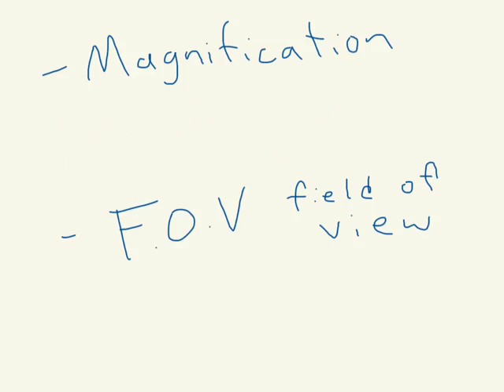Okay guys, so today we're going to look at some of the problems that we've been having in the lab dealing with microscopes. I know we've been getting confused on these two. Been dealing with magnification and the field of view, and been getting those two mixed up and not really quite grasping the concepts of how they're related. We're going to address those today.